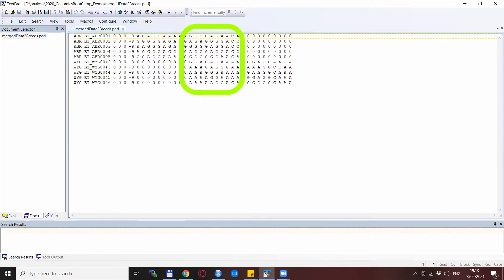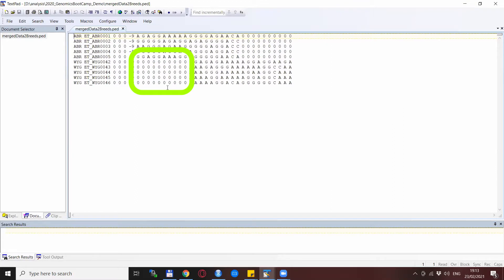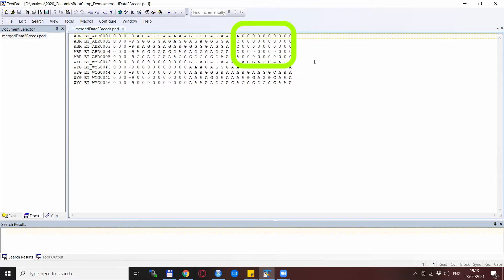You see that the SNPs on the second chromosome were present in both datasets so these are merged properly, and whatever was not present in the dataset, that is the SNPs from the other breed, these are all set to missing. Likewise, which was not present in the first dataset but was present in the second dataset, that was also set as missing in the first one for the Abragalas.